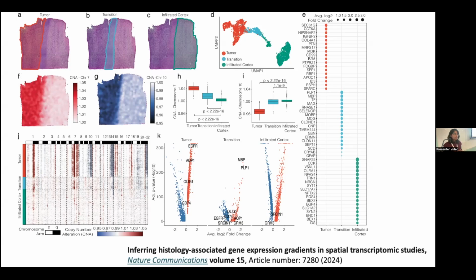All right. So what it means to do spatial clustering is really to understand domain structure, broad collectives of cells. And that should be driven by knowledge of your tissue. If you don't have knowledge of your tissue, I think you should start with the simplest method. Look at your cell type profile, see how it compares with your single cell data. Look at your H&E staining and see if there's anything obvious. We underestimate the amount of information that we can see through our own eyes when we just load an image. So use all of this.